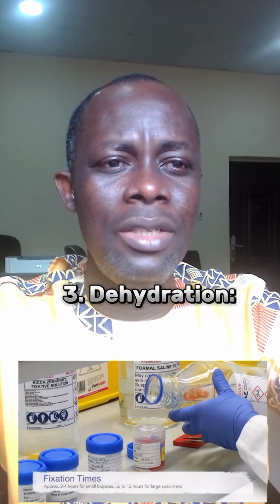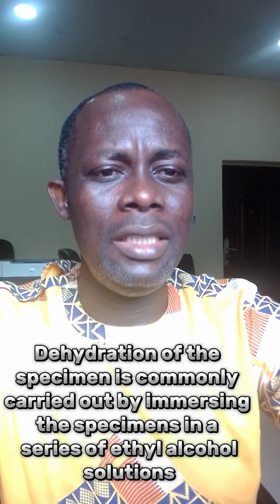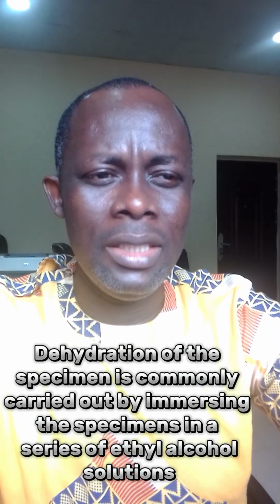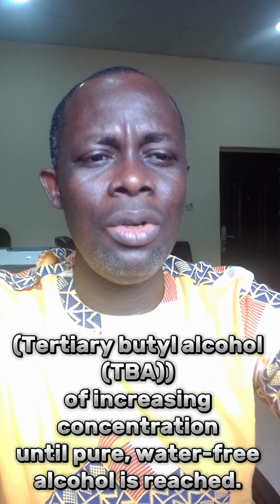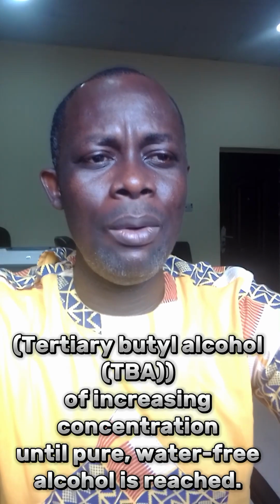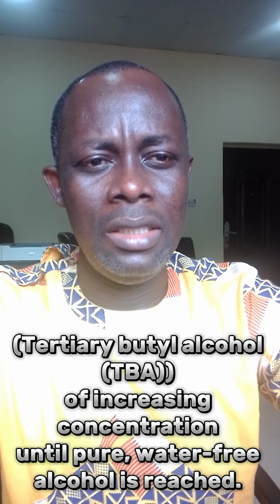Dehydration involves immersing the specimen in a series of ethyl alcohol solutions, especially tertiary butyl alcohol (TBA), of increasing concentration until a pure water-free alcohol solution is reached.